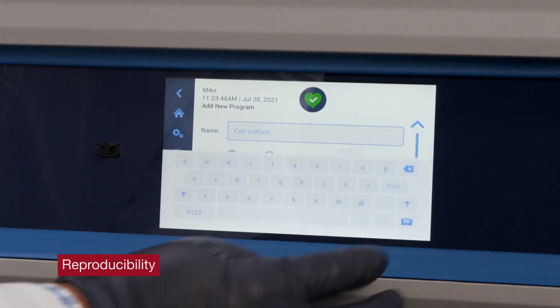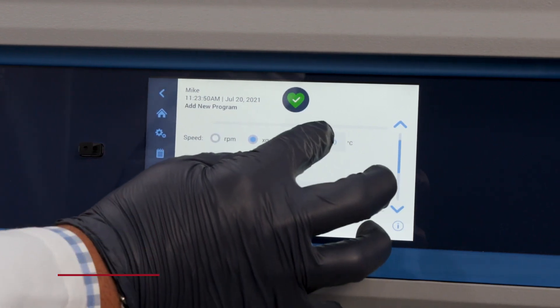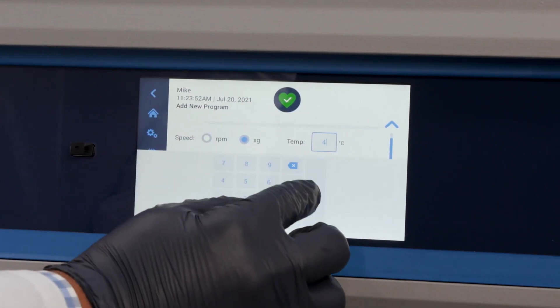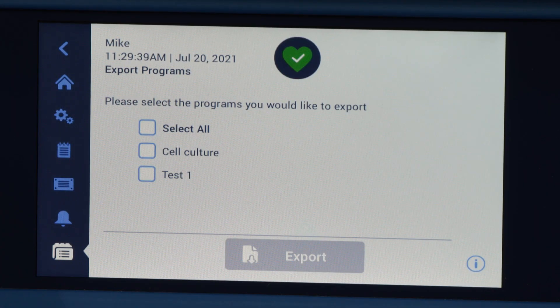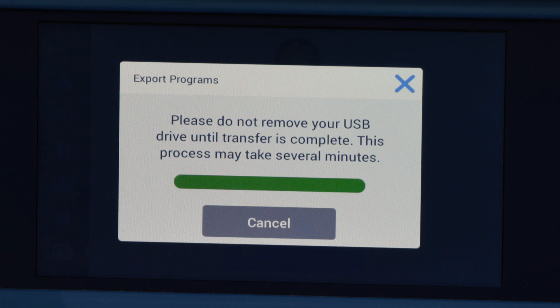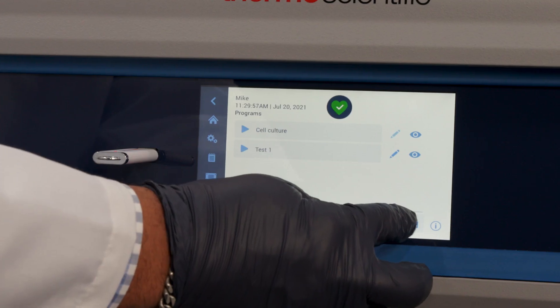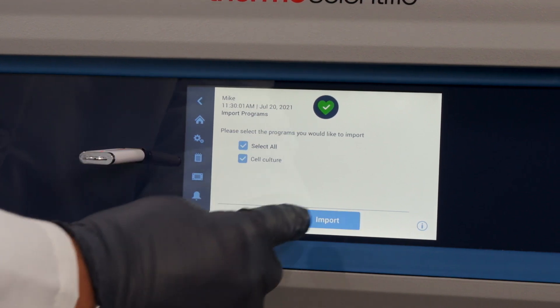The X-Pro general purpose centrifuge allows users to easily create and save programs for use. You can share programs between centrifuges. The import-export button allows you to export programs you have created on one centrifuge and import them onto a second centrifuge of the same model and series. Just insert the USB drive, export, transfer, and reimport the files to the second unit.